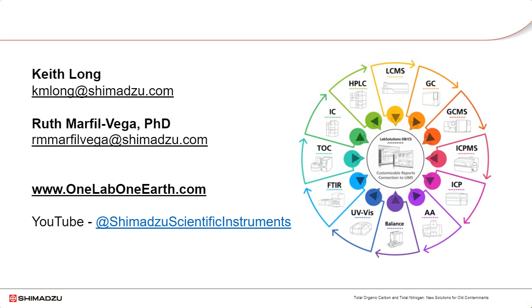Perfect. We have another question asking about moving from the TOC-V to the TOC-L. A lot of people have been using the TOC-V for a while, and they want to move to the TOC-L, the combustion system. Is there a virtual advisor that people can use for the TOC-L?